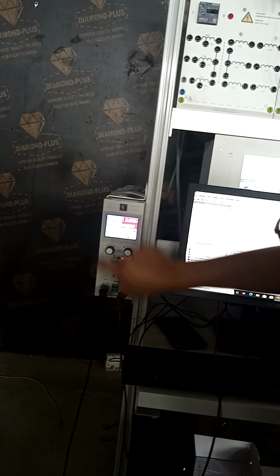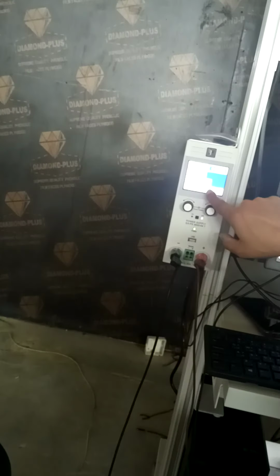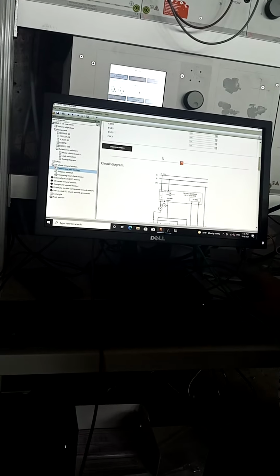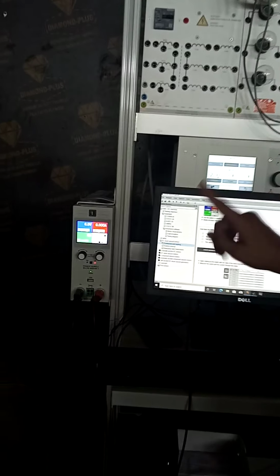You can click here, and then I can give 250. Enter. Check it. 250. Okay. Next.